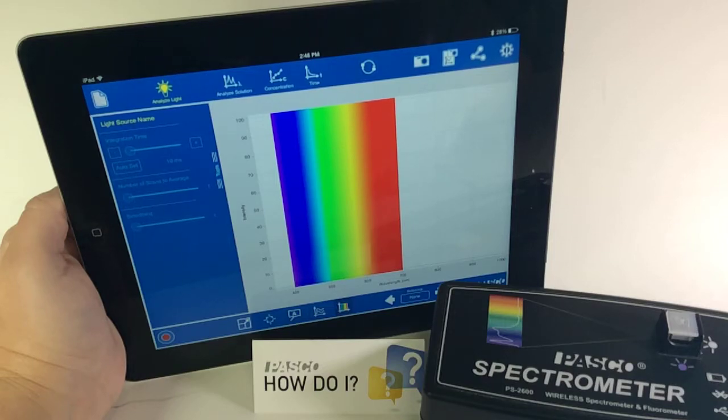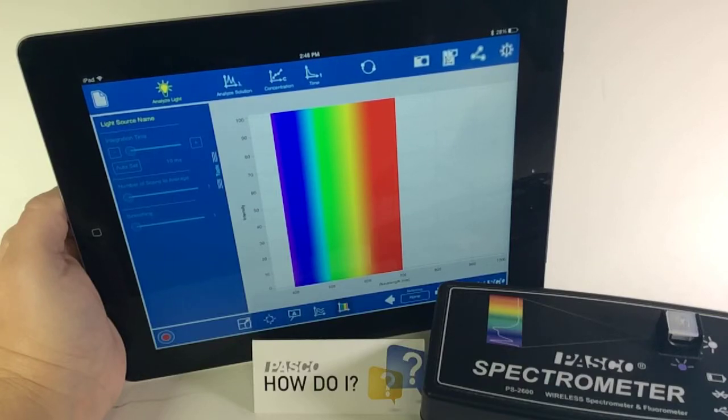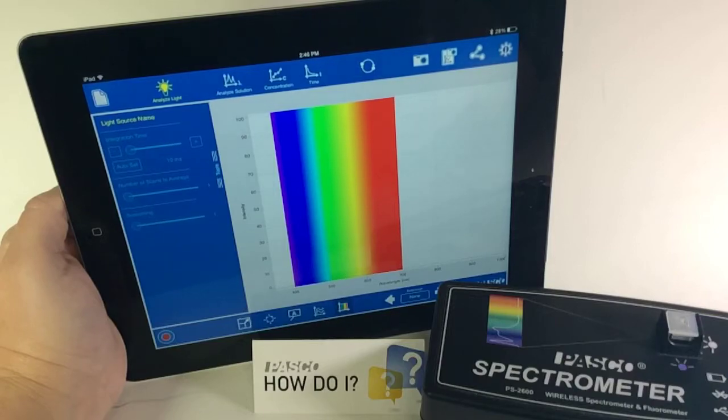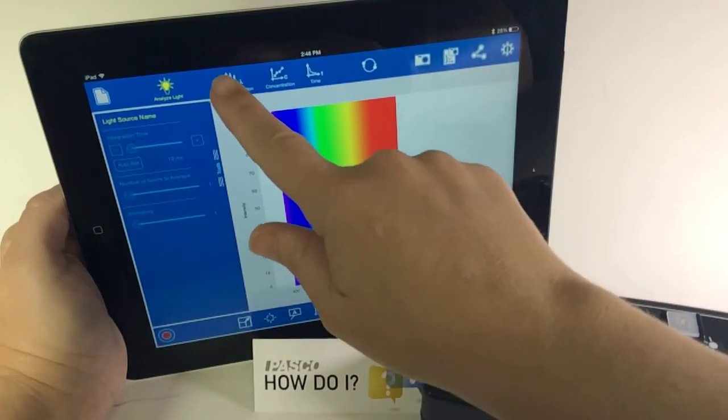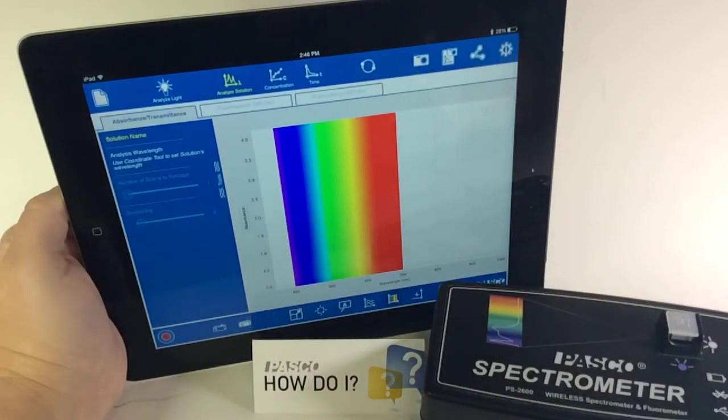How do I calibrate the wireless spectrometer before use? When you open the spectrometry app, the default is for it to open to Analyze Light. So first you would want to select the Analyze Solution option.